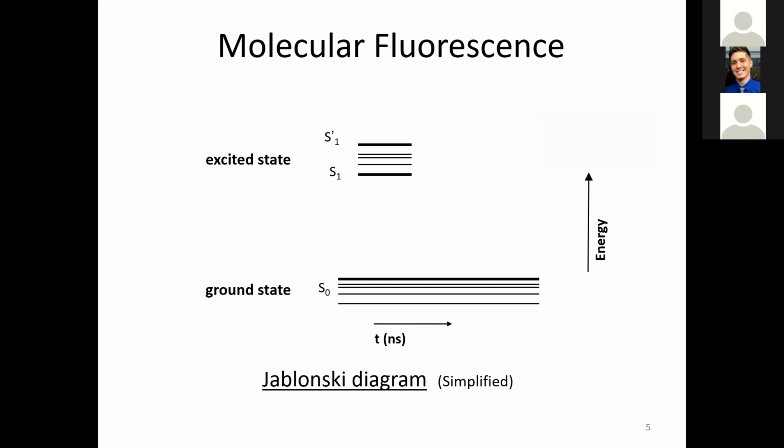So when we talk about molecular fluorescence, what is happening at the molecular level? We have two states of our fluorophores: a ground state and an excited state. The ground state is where your fluorophores exist before we hit them with any light. They're just down there chilling, waiting to be excited. We excite them with a wavelength that we know they'll absorb. We've all looked at absorbance and emission spectra for our different fluorophores, or at least I hope we have.